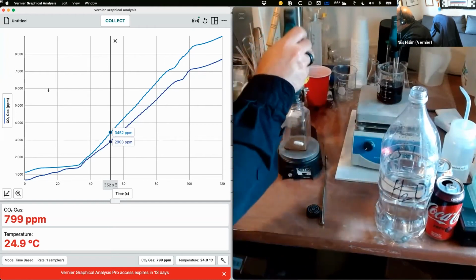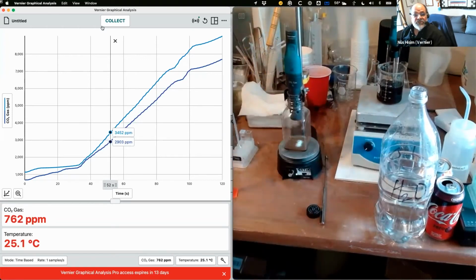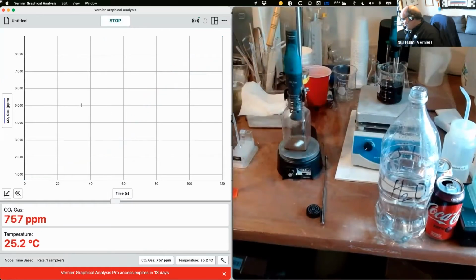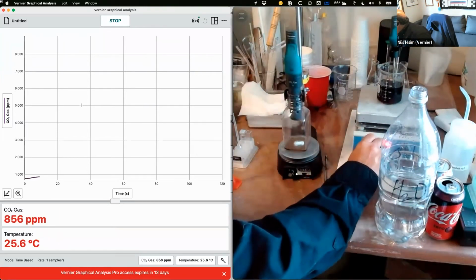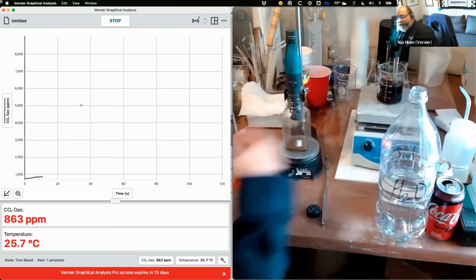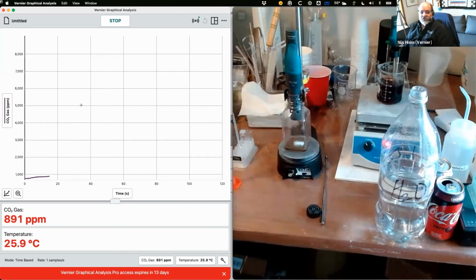But it's a measure of it. And so this is one way, as you can tell, I hope, it's not very difficult to set up. It's not very difficult to run. It goes pretty quick. Ideally we would want the students to do maybe 5 runs, so that you get some points. 3 is really a small amount.